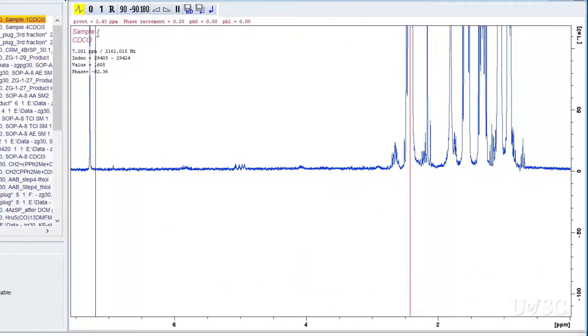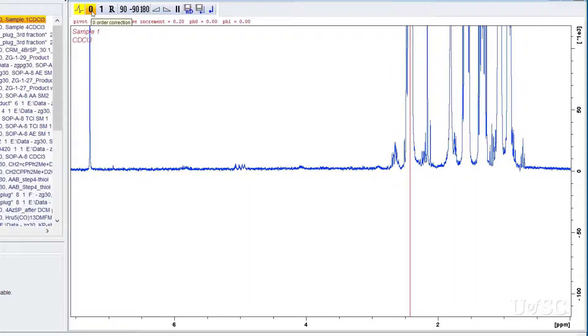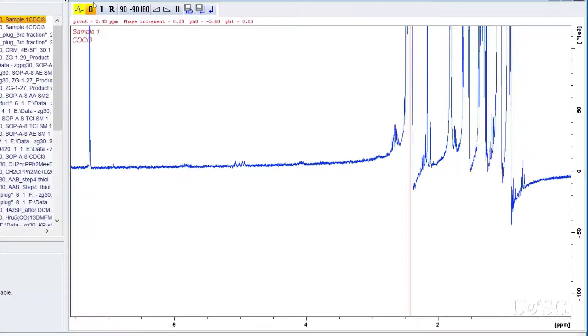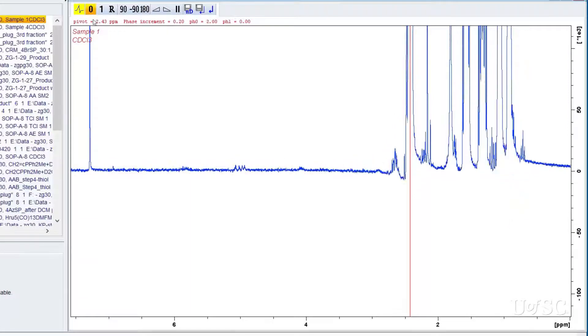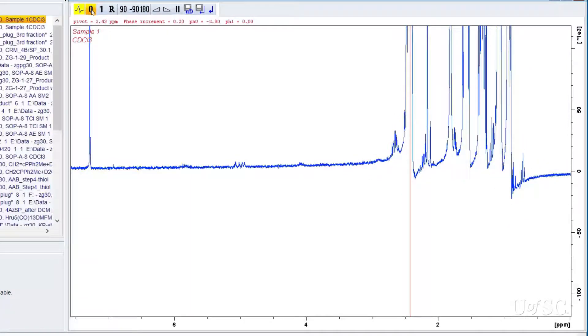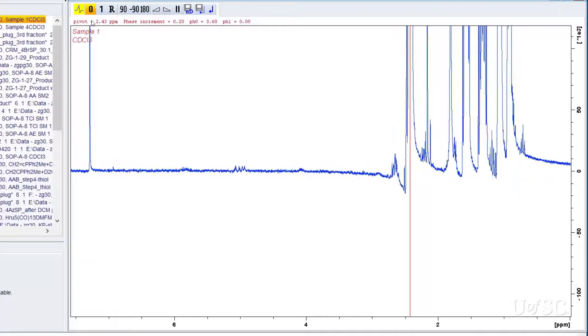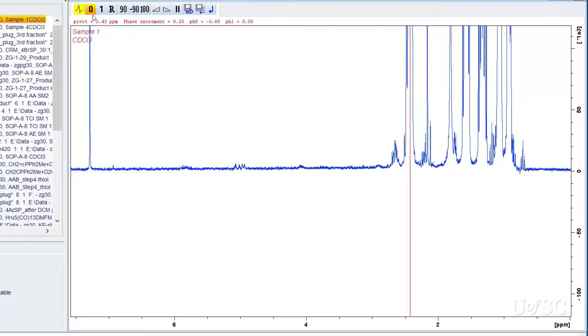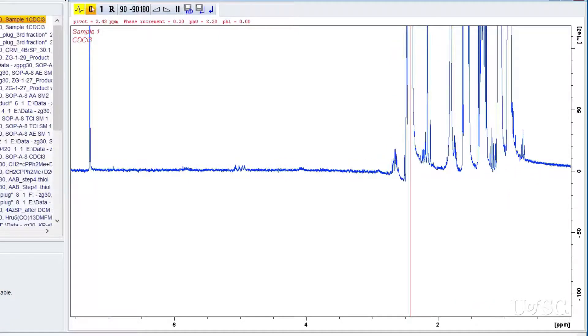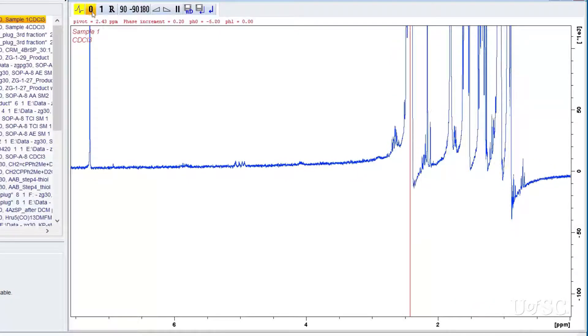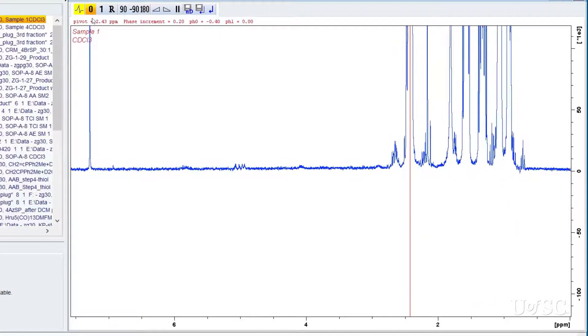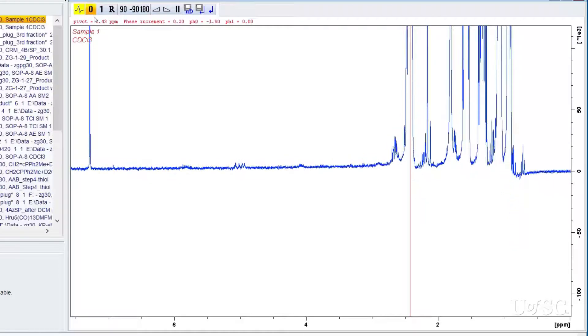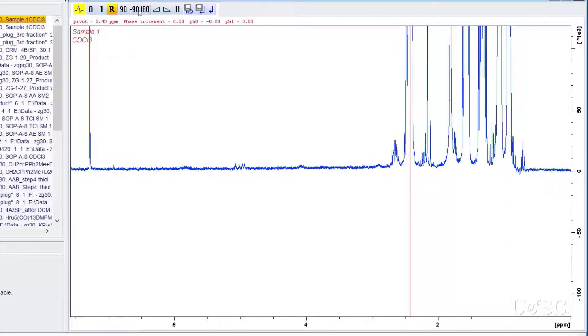Move the mouse to the zero button. Click and hold the left mouse button and make adjustments by moving the mouse up or down. This controls the zeroth order correction which makes changes across the whole spectrum. This is considered the frequency independent phase correction. The sensitivity of the adjustment can be changed with the two triangle icons which will either ramp up or ramp down the sensitivity.